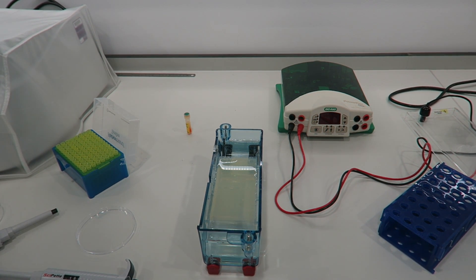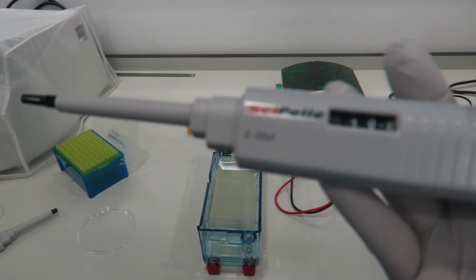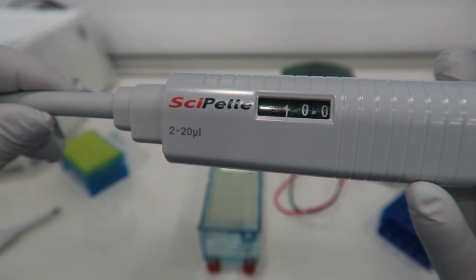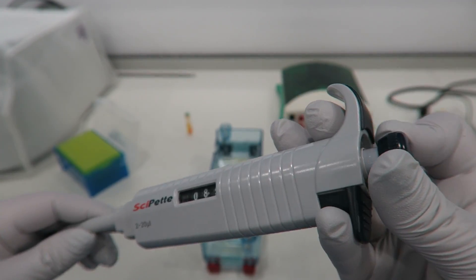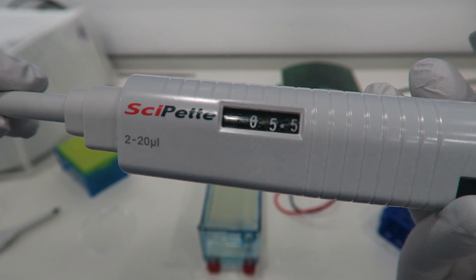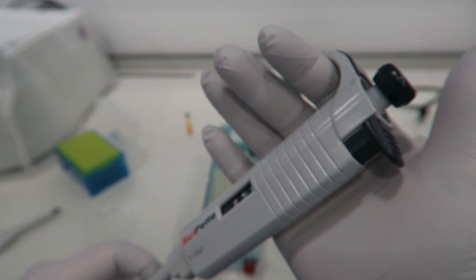Loading a gel takes a lot of care and attention. It involves very small volumes on pipettes. This pipette will do between two and 20 microliters. You need to set the amount you want. This is generally between five and 10 microliters of your sample.